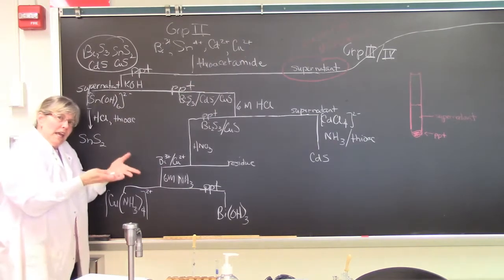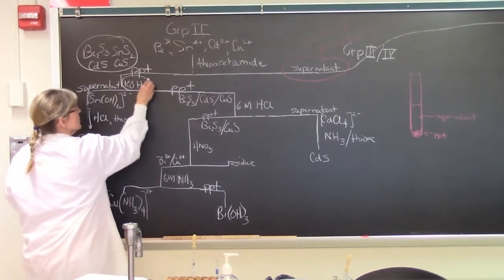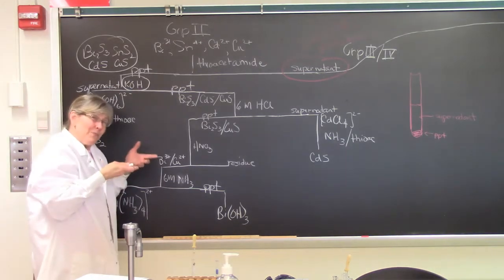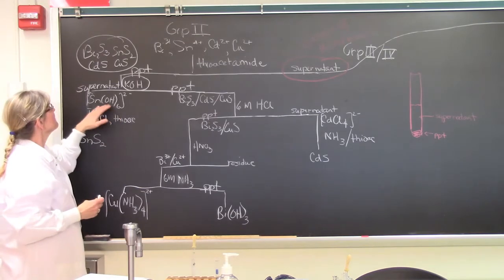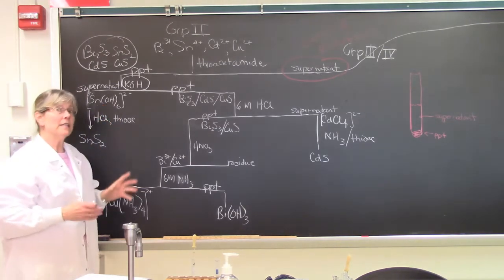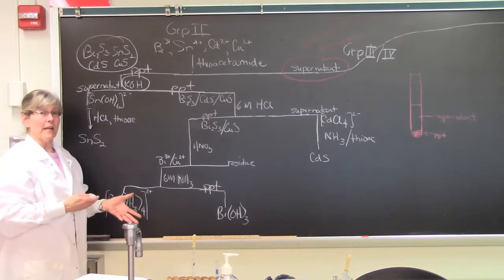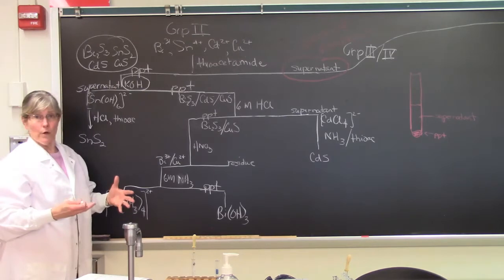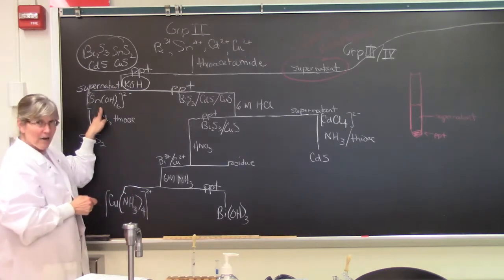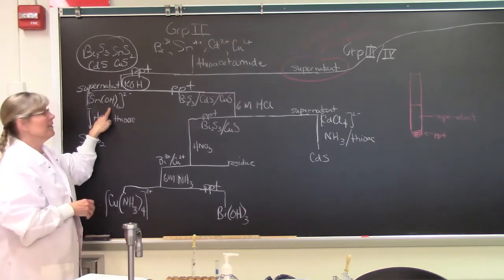All right, after we have got these precipitates isolated, we're going to adjust the pH. We're going to put the pH up a little bit, obviously, since we're adding KOH to it. That's a base, so we're going to tip it up a little bit, and a really cool thing happens. Now, technically, tin sulfide should stay as a precipitate. And if you had it in ammonia or other bases, it would. But tin forms a complex ion with hydroxide.